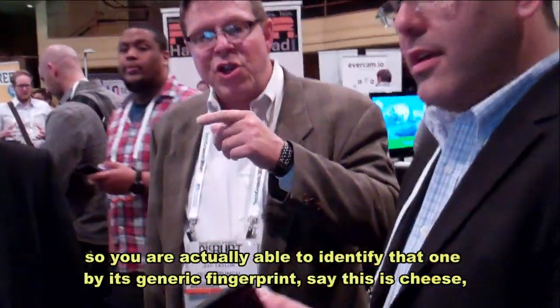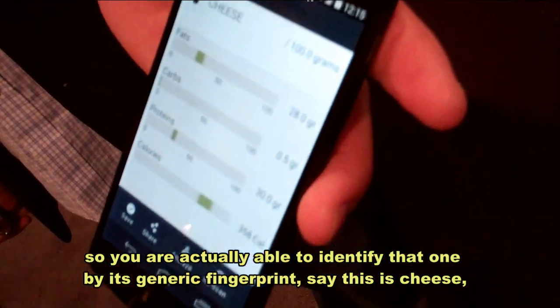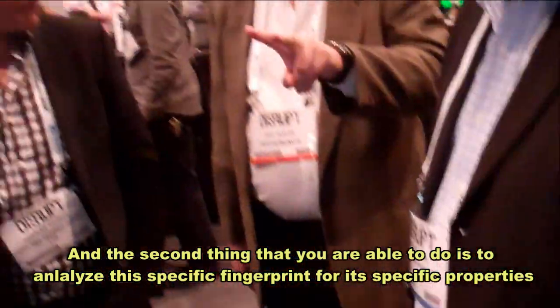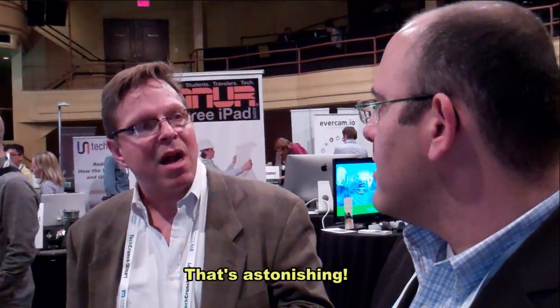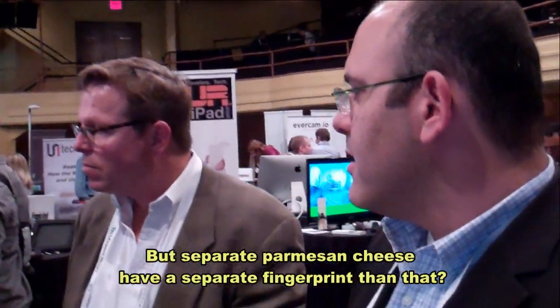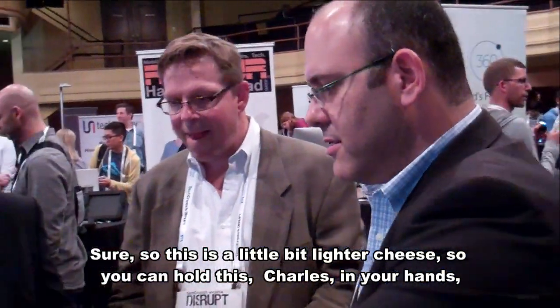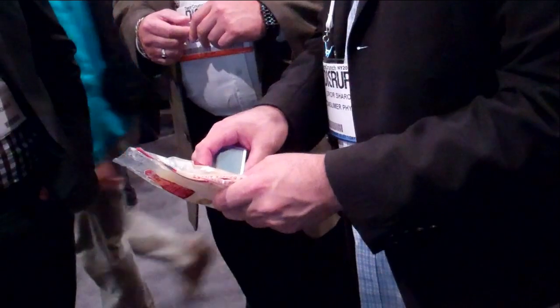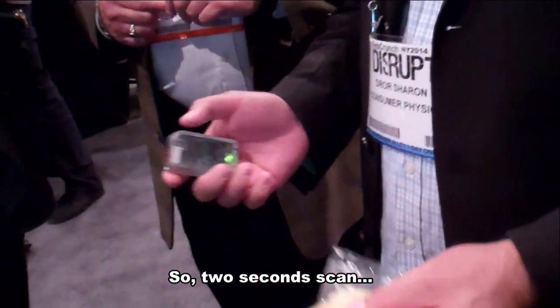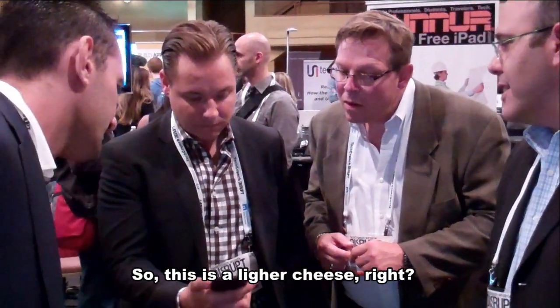360 calories. So you were actually able to identify that, one, by its generic fingerprint and say this is cheese, and the second thing you were able to do is analyze the specific fingerprint for its specific properties. So this is a lighter cheese — you can hold this in your hand — and we're going to scan it again through the plastic. Two-second scan through the plastic. Oh, this is lighter cheese, right? Exactly. So this is 360 calories.